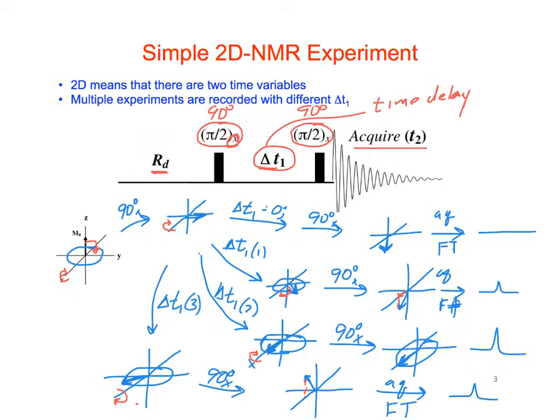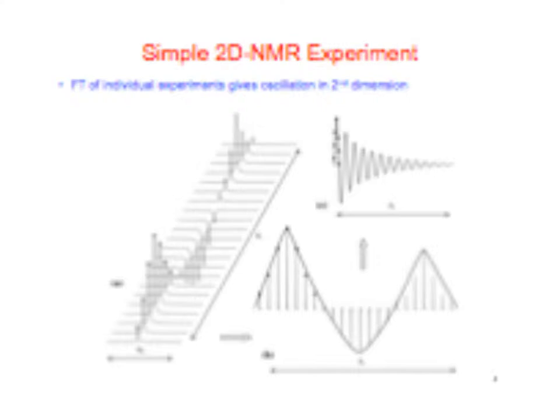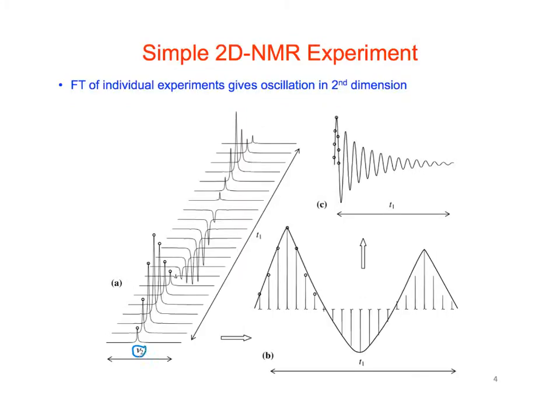It would go negative, and we would get something that looks like this. Okay, so this frequency 2 comes from, on the last one, we have our T2, and we've done this Fourier transform. Okay, so we have different time domains. So these are all T1.